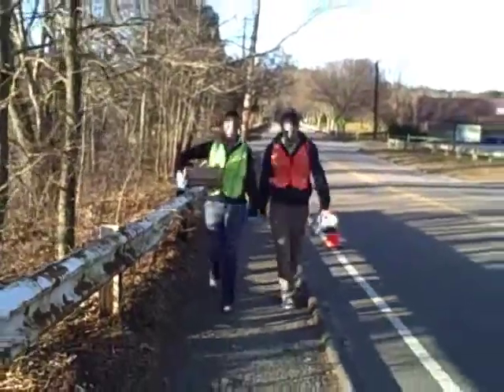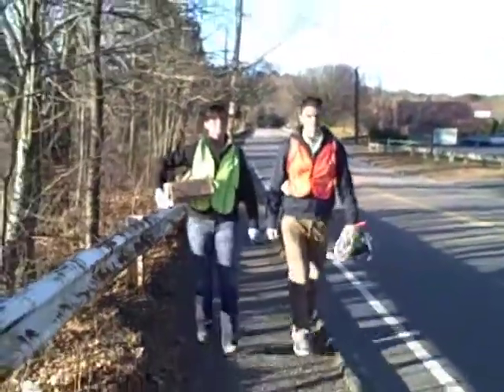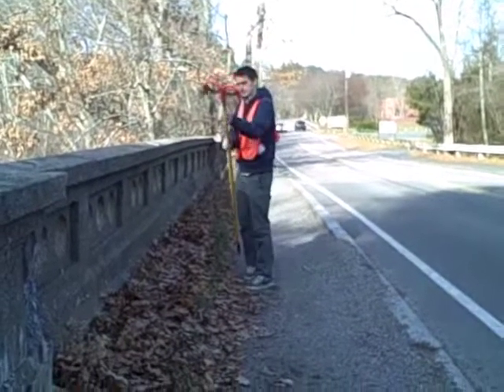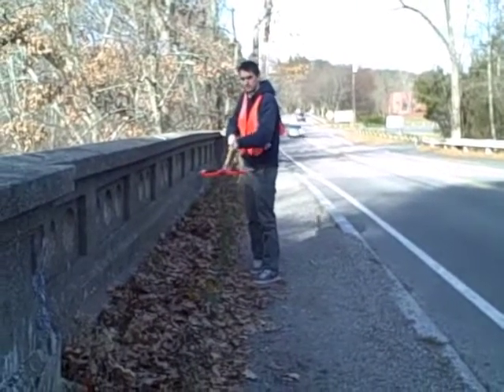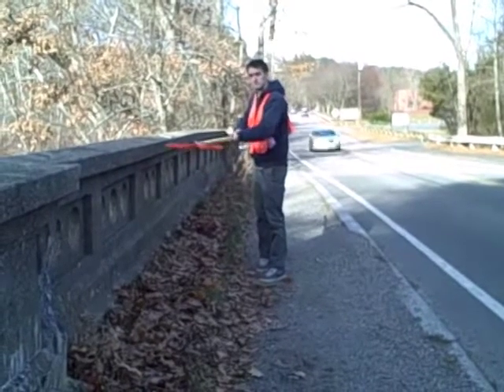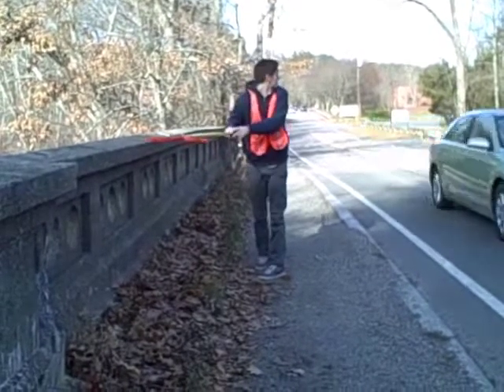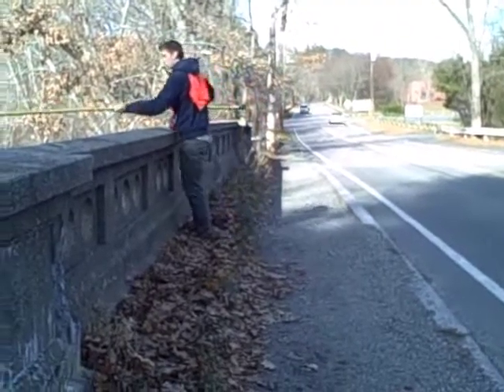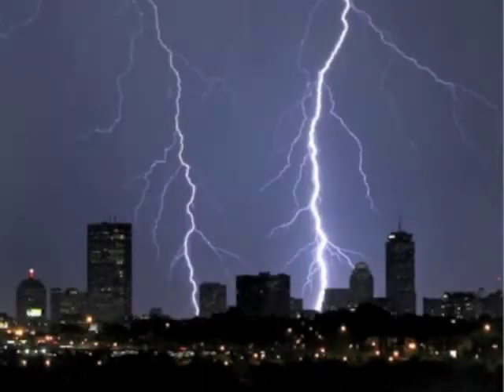When carrying the sampling equipment, hold it by the actual basket, not the rope. For the sampling pole, it should be carried unextended, and you should be aware of your surroundings before extending the pole at your sampling site. Make sure you won't hit passing cars, your sampling partner, or any low-hanging branches or power lines. Finally, although sampling can proceed in rain or snow, you should never sample if you hear thunder or observe lightning.